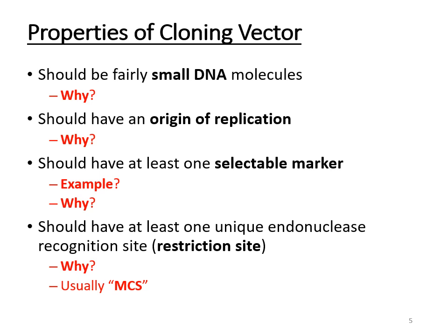It maintains that plasmid, those new genes, in the bacterial population, which is really valuable to you, because what good would it be if you got one piece of DNA into one bacteria and that's the end, it couldn't replicate it? It'd be useless to you, waste of money, waste of time. So origin of replication is important.